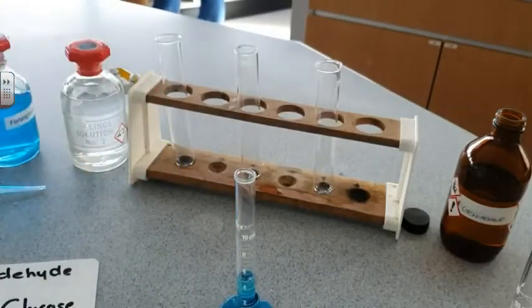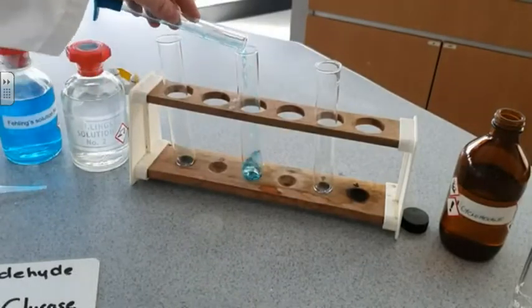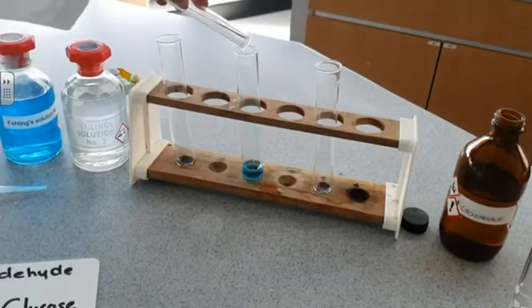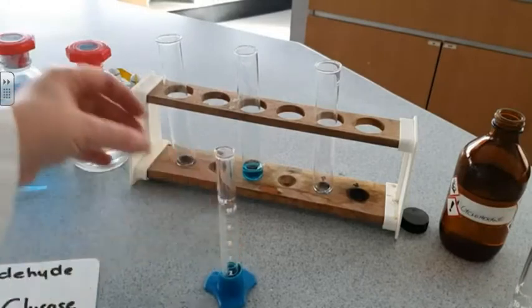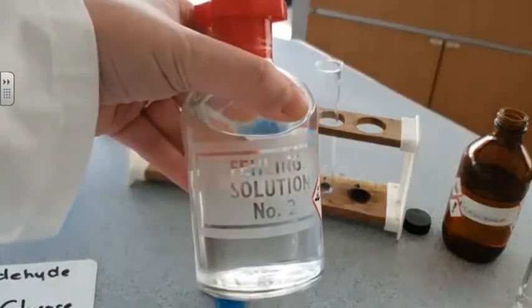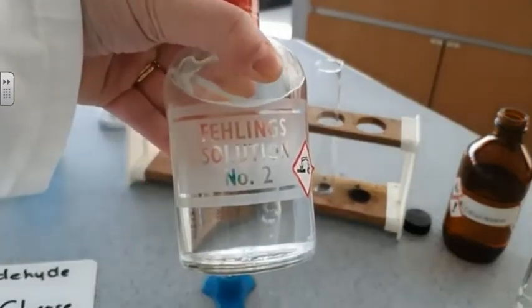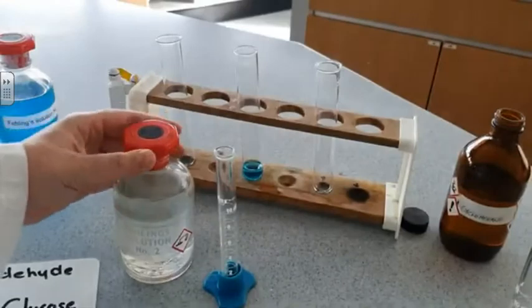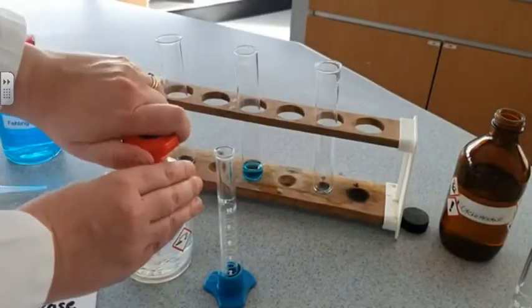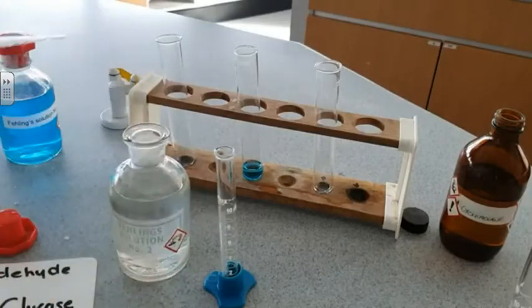And copper 2 ions in Fehling's solution will react with aldehydes, because aldehydes can be oxidized to carboxylic acids, and therefore the copper 2 ions in Fehling's solution will be reduced. They're reduced to copper 1 oxide. Copper 1 oxide is a brick red precipitate, so if you have an aldehyde present and you're using Fehling's solution, you should see a brick red precipitate.